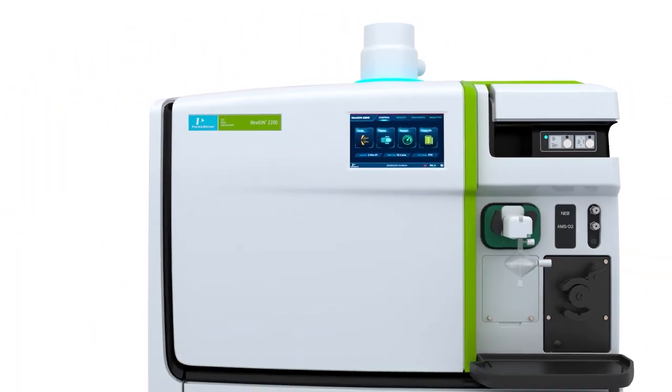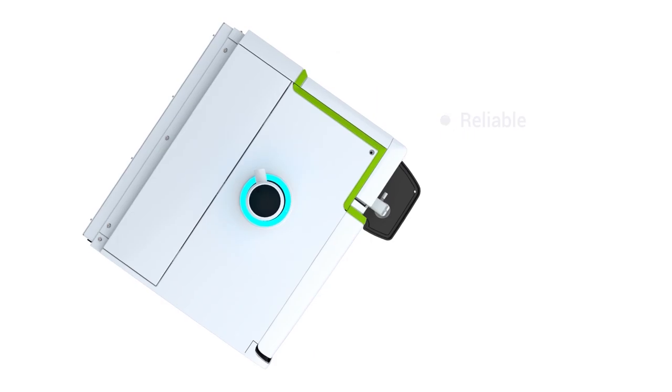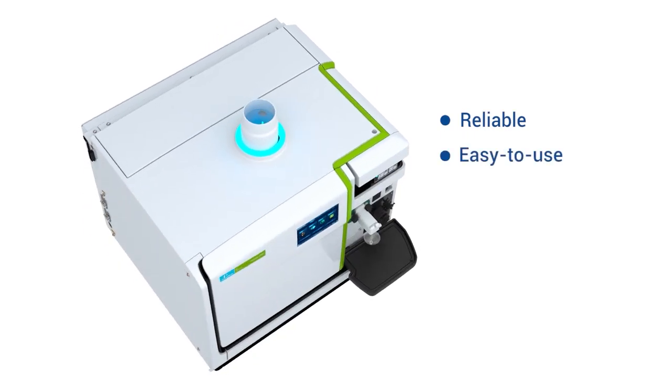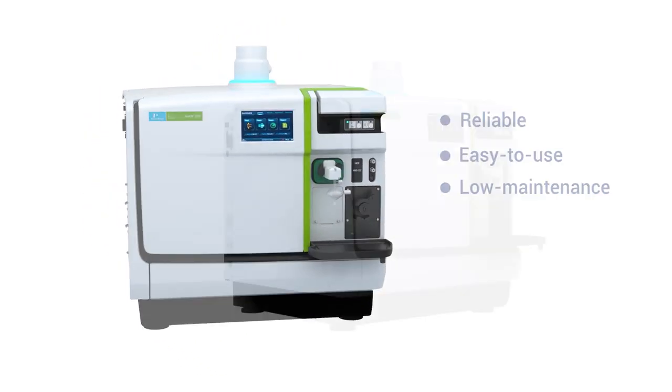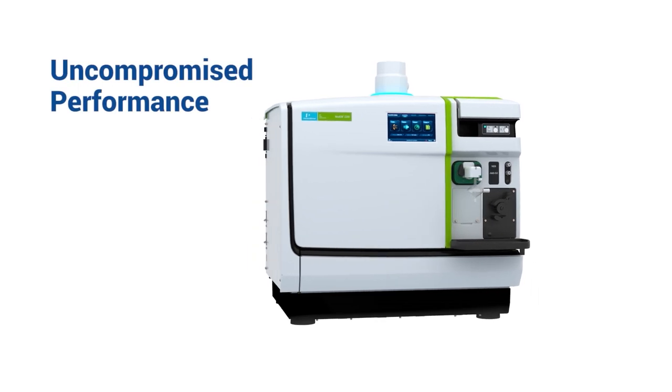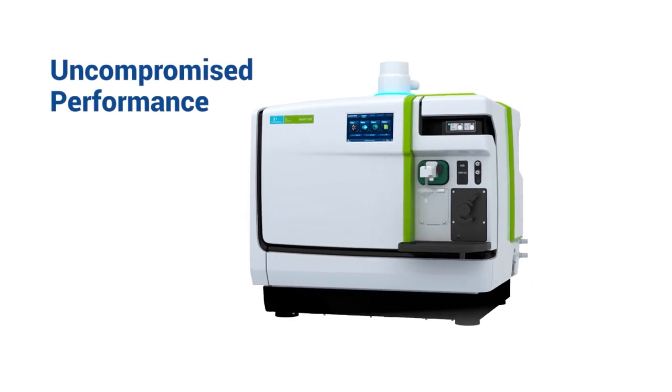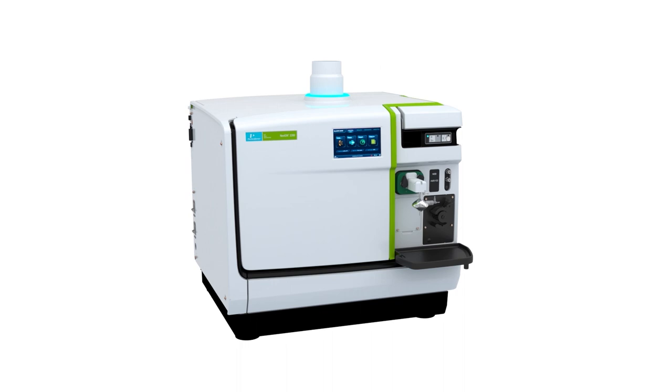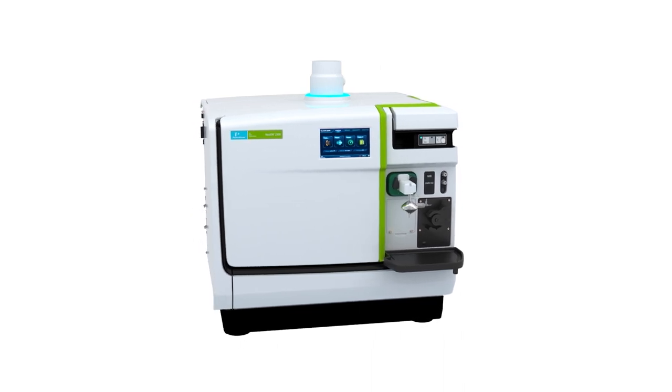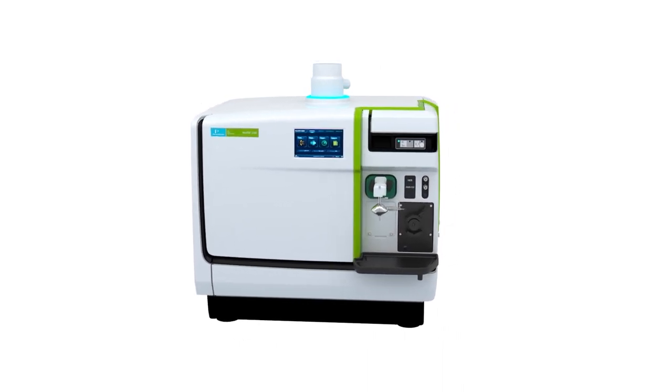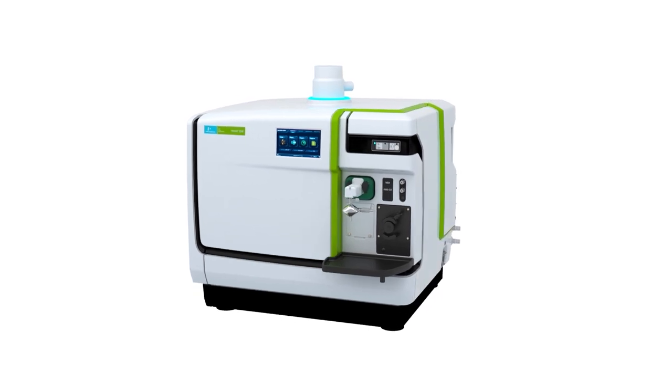The NexION 2200 builds on a strong tradition of reliable, easy-to-use, low-maintenance instrumentation, delivering uncompromised performance for accurate, repeatable results. Let's take a closer look at what makes the NexION 2200 your go-to solution for trace elemental analysis.